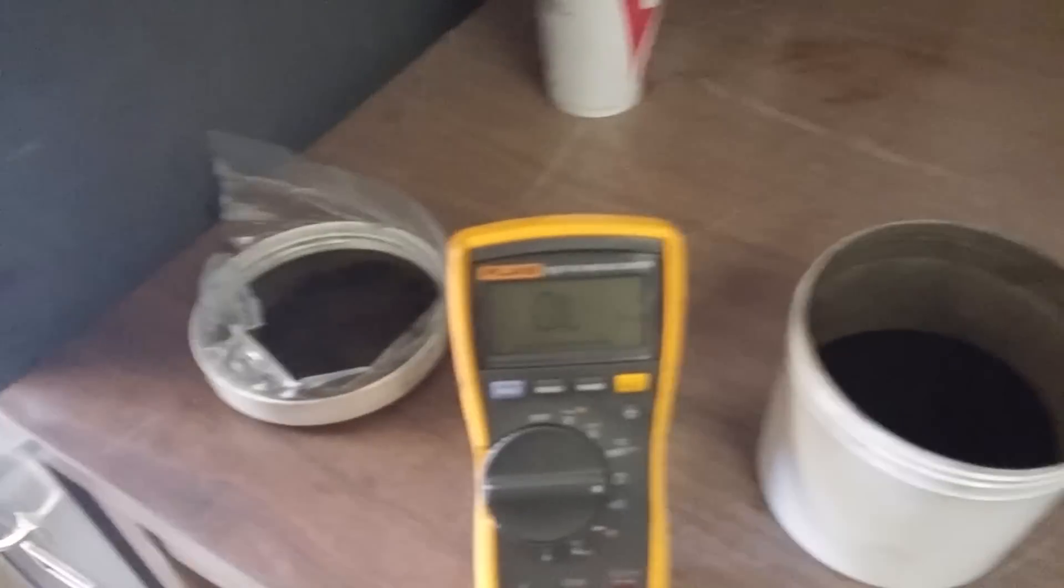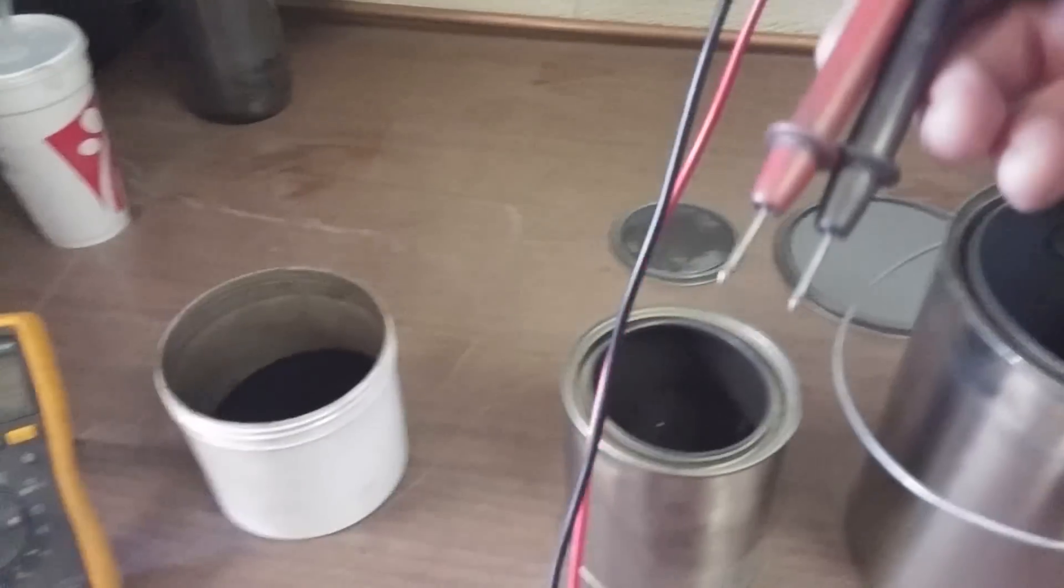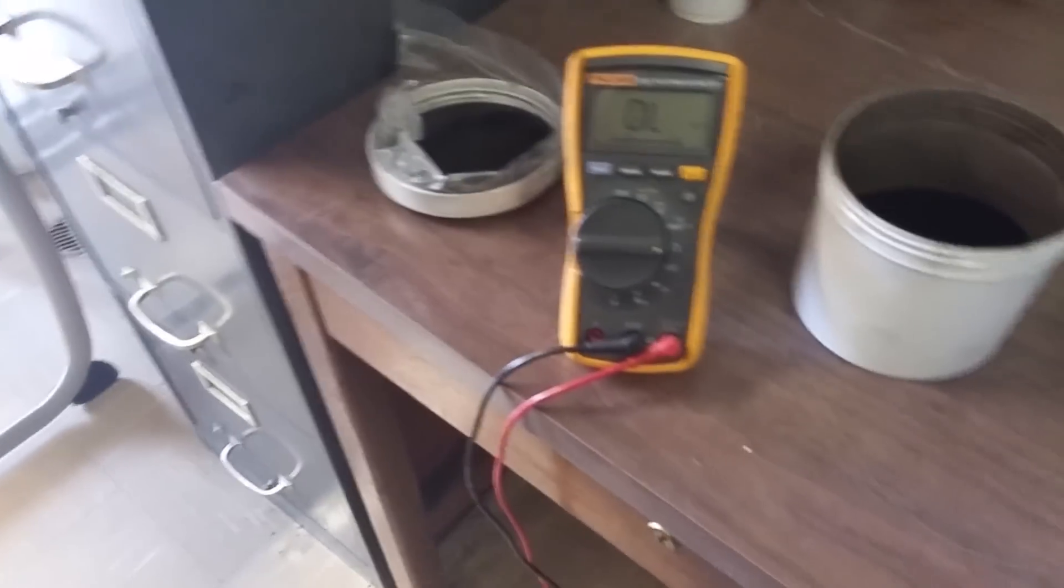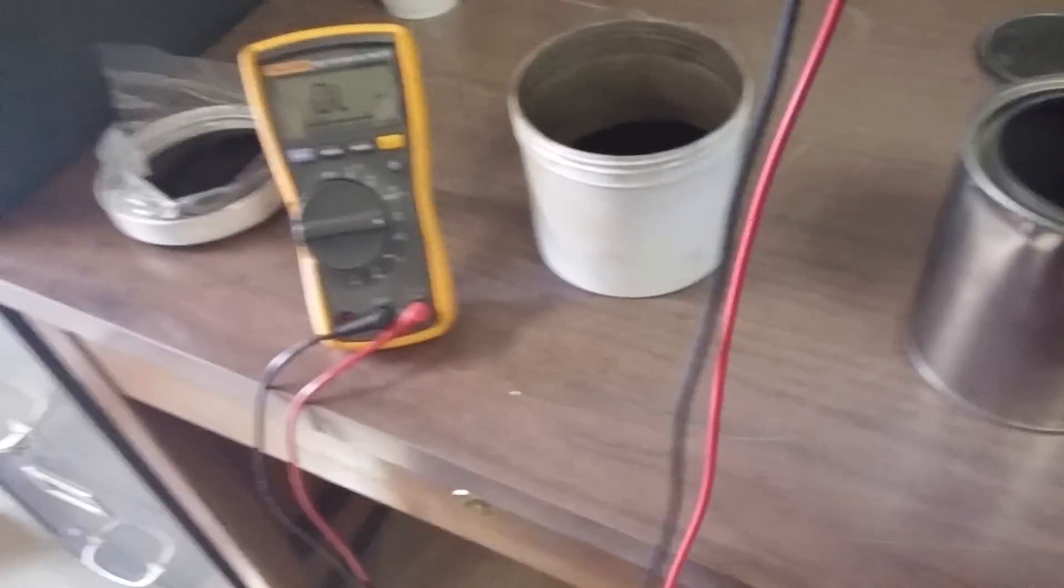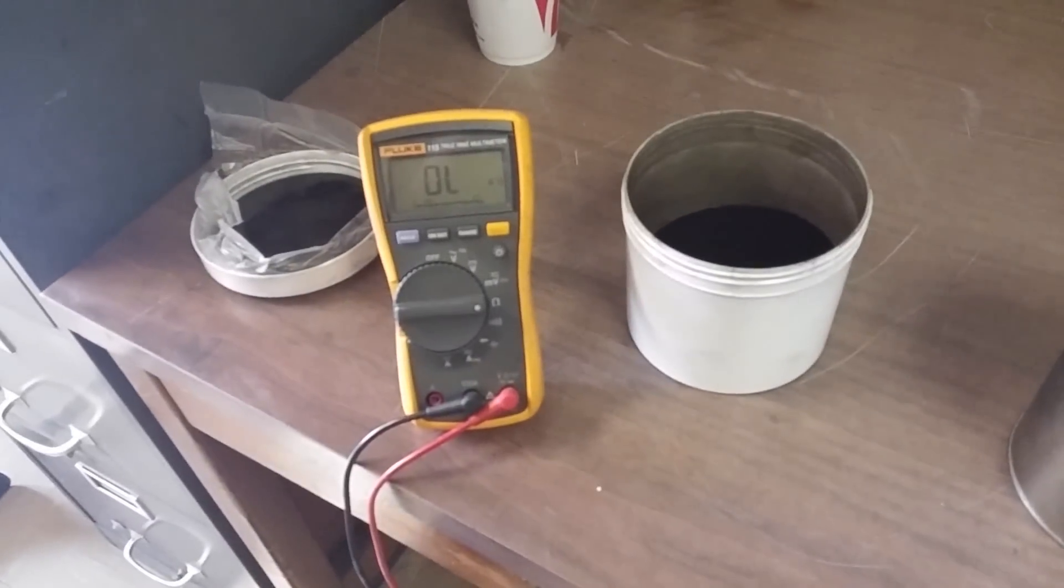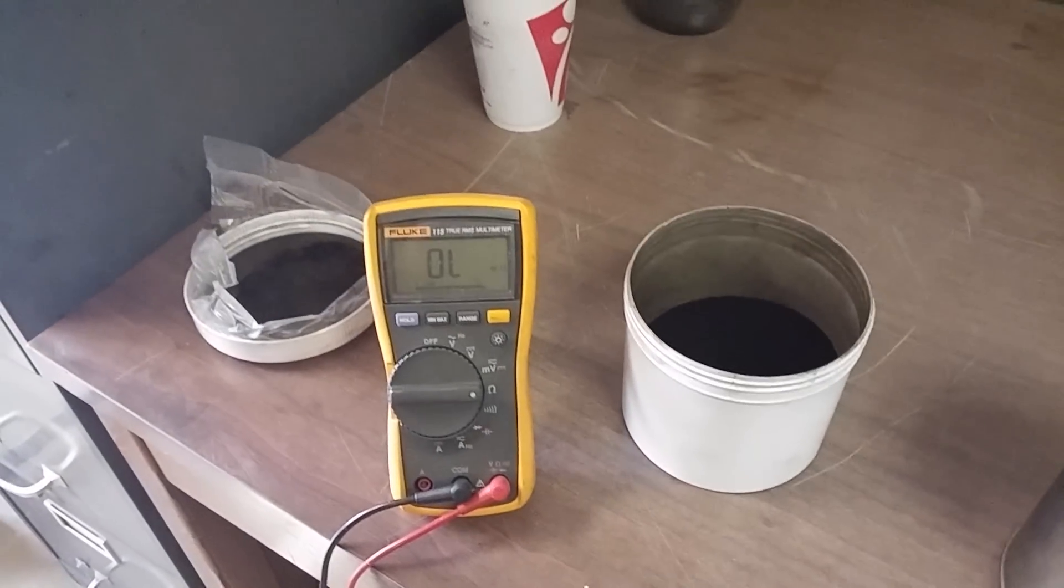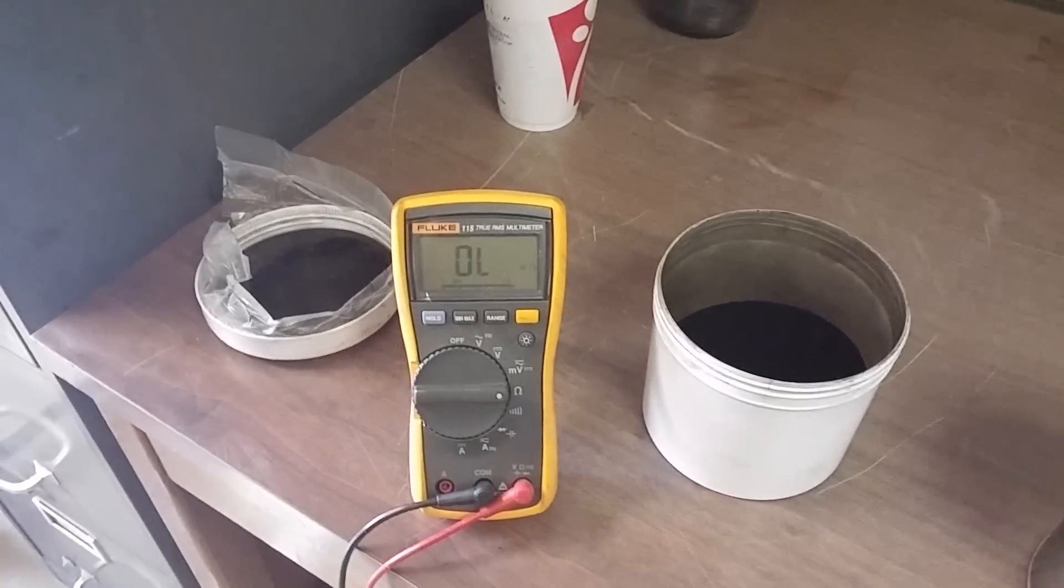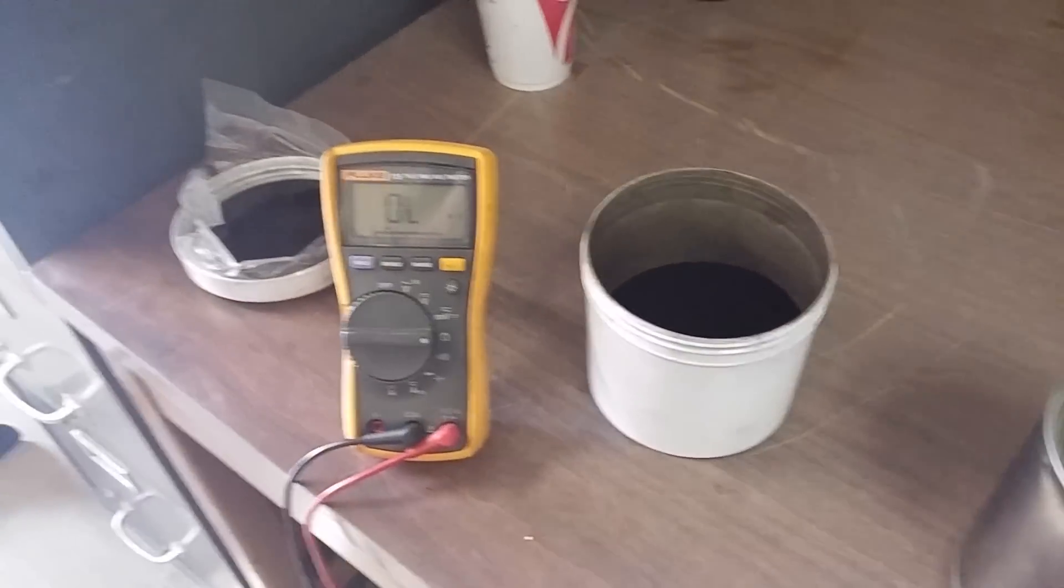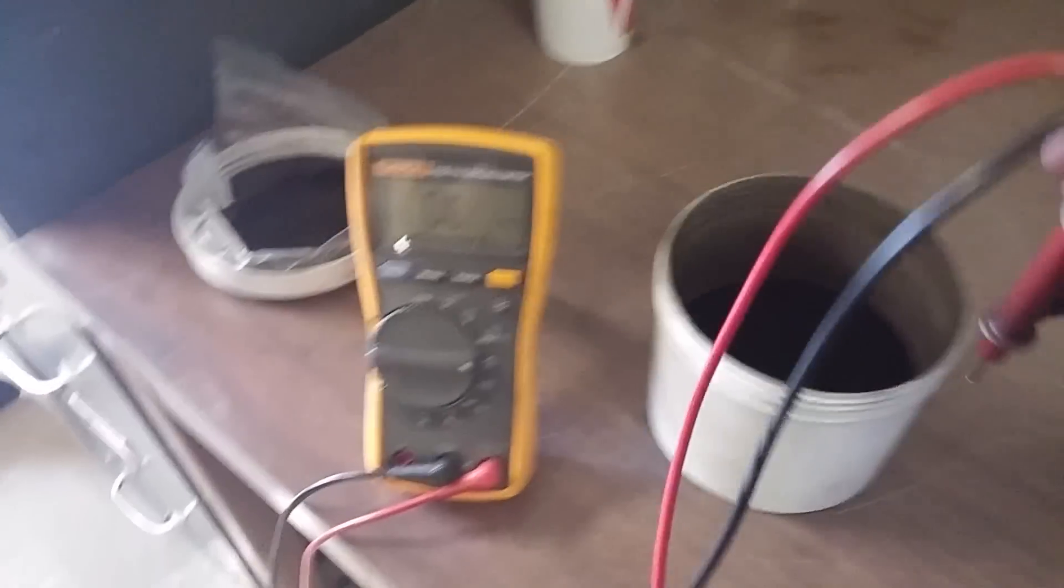Here's the Fluke meter. We're going to take the probes and put them together with about 1.5 centimeters gap distance for the powder. Now this is not super scientific, it's just a bar of reference so you can understand how good the powders conduct.